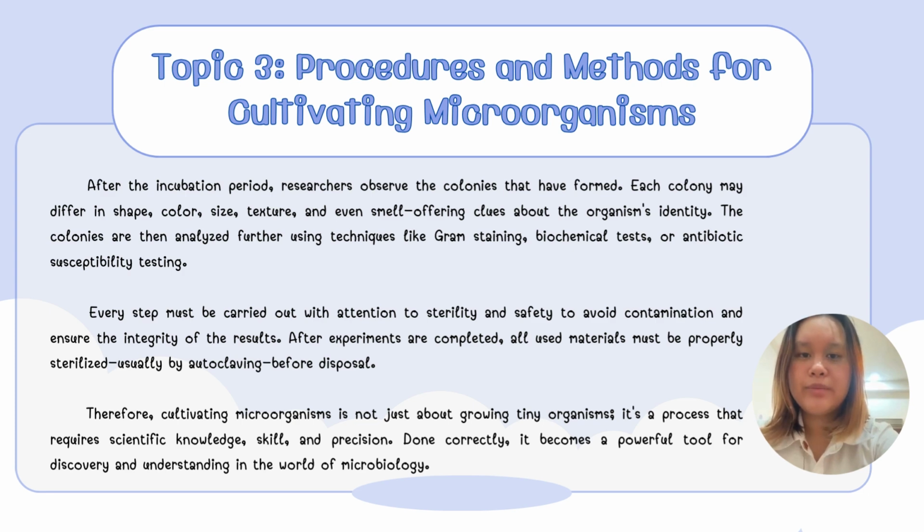After the incubation period, researchers observe the colonies that have formed. Each colony may differ in shape, color, size, texture, or even smell, giving clues about the organism's identity. The colonies are then analyzed further using techniques like gram staining, biochemical tests, or antibiotic susceptibility testing.